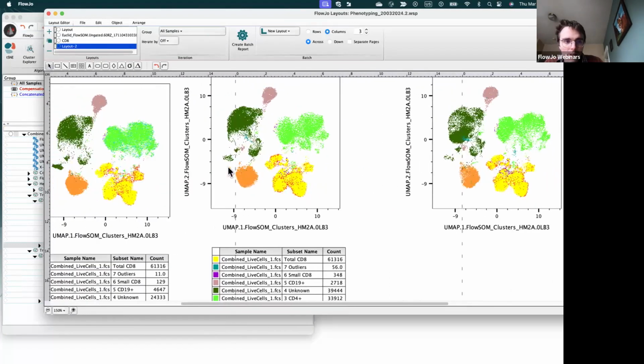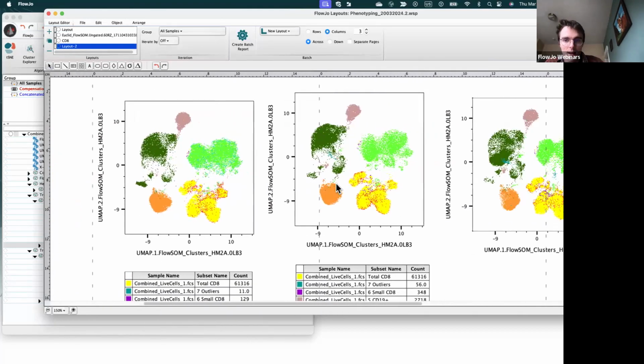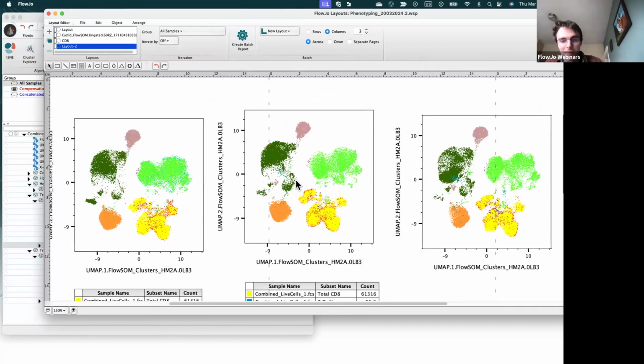And yeah, as far as differences go, again, maybe some light depletion up here. Okay, well, this far right one, I guess, probably has the most depletion, it looks like, of CD4 phenotypes, as some change in state. So yeah, again, T-Rex can help us really dive deeper in, but if I do some specific clustering on our CD4 cells here, I'd expect we'd see some substantial changes between this condition and the other three. The other conditions look somewhat similar to each other though.